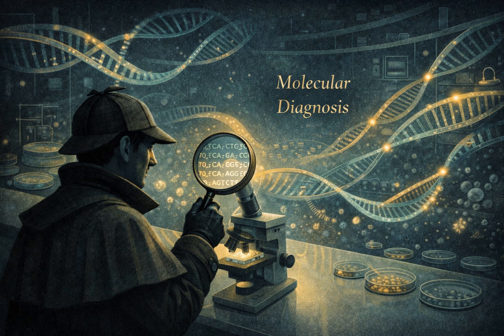Exactly, and then you just do it again. Denature at 95, anneal at 55, extend at 72. 2 copies become 4, 4 become 8, 16, 32. It's exponential amplification. 2 to the power of n, where n is the number of cycles. Precisely. If you run 30 cycles, which takes maybe an hour or two in a modern machine, you go from a single starting copy to over 1 billion copies. That's the power of PCR. That's how you can detect an incredibly small amount of a pathogen. You don't find the signal, you manufacture the signal yourself.